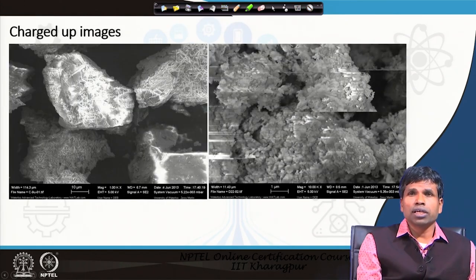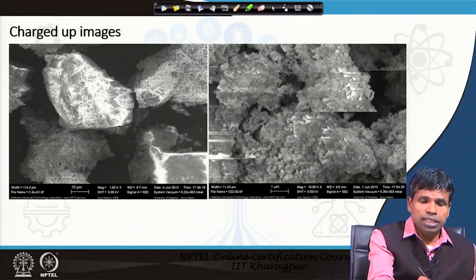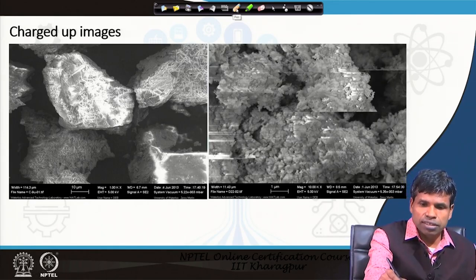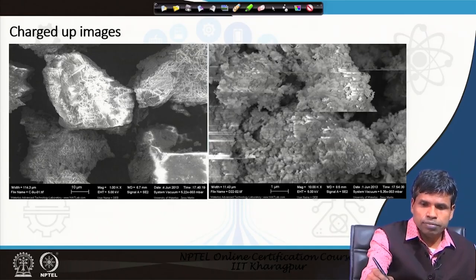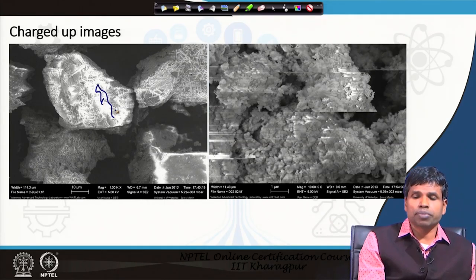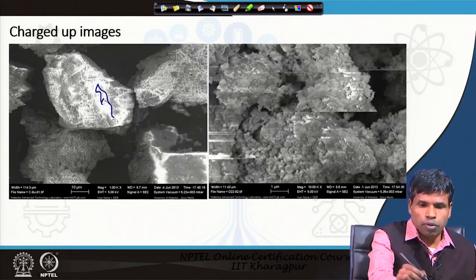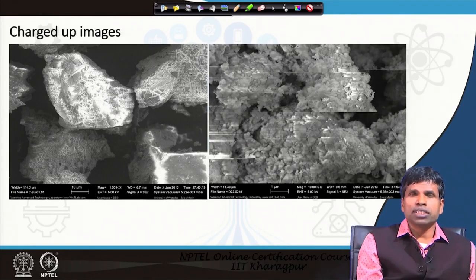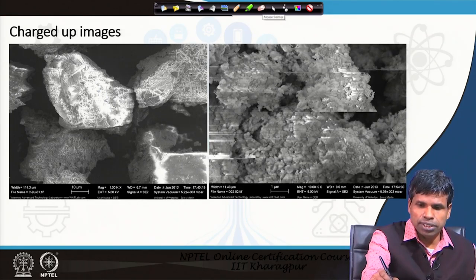Here you can see a charged-up image with no metal coating — on the left side image there are very bright regions indicating charge accumulation, and no clear surface image is obtained. In the right side image, the sample is moving and there are lines — these types of problems occur when the sample is non-conducting or insulating in nature.